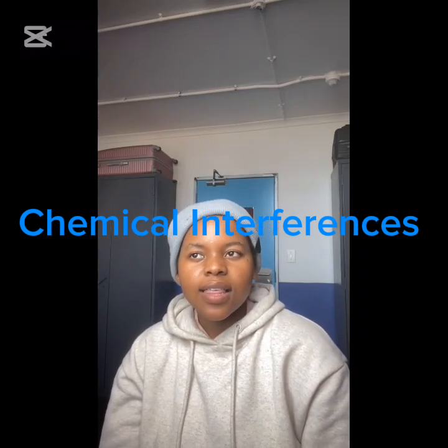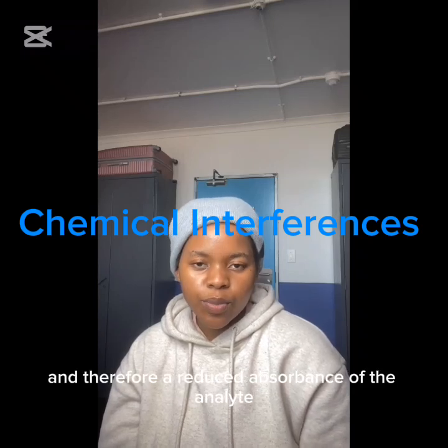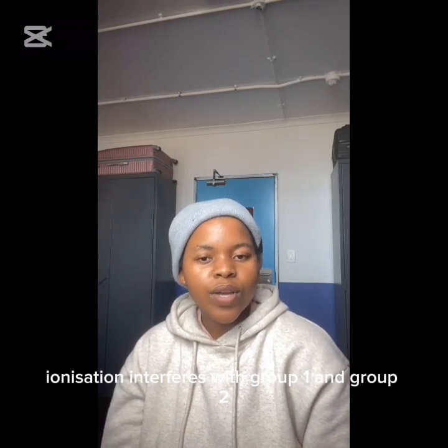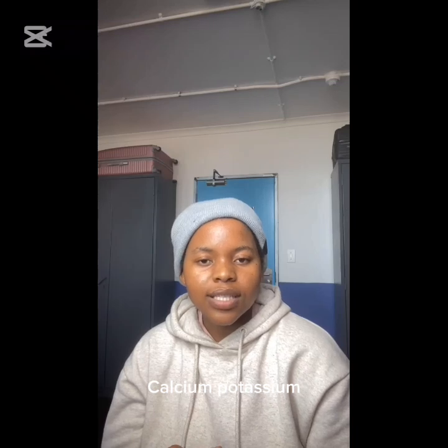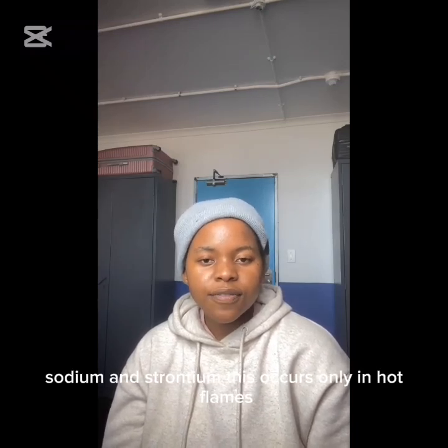flame. There are fewer atoms present and therefore a reduced absorbance of the analyte. Ionization interferences affect group 1 and group 2 elements only. This includes barium, calcium, potassium, sodium, and strontium. This occurs only in hot flames.